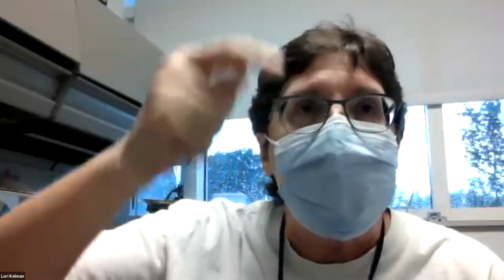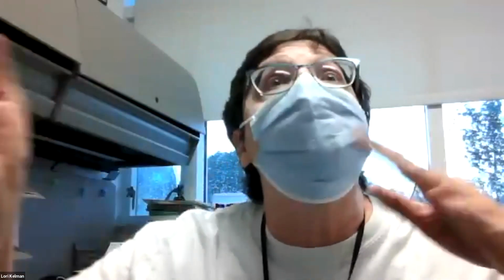The students made a standard curve. Really, the sole purpose was for them to look at their pipetting. They did the whole plate by hand, and to look at their pipetting and either go, hey, this is okay, or, oh my gosh, I thought I learned this and it looks like I have more practice I have to do. And if you're sort of just getting into it, I think that's actually a really good use for it.